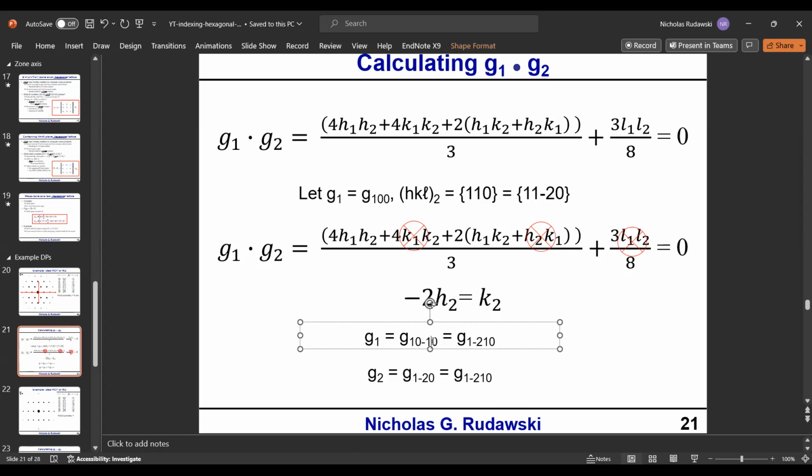Oops, sorry. I end up with 1, 0, 1 bar, 0. Okay, so there's my answer. Okay, and we mathematically prove that it works. Okay, because it's consistent with the ratio, and the math also works. Okay, so that's our solution. That's our solution for doing this.